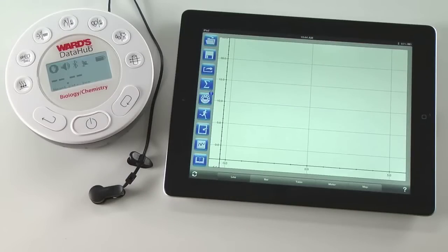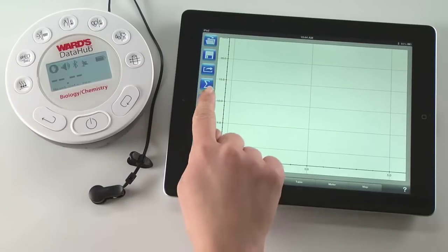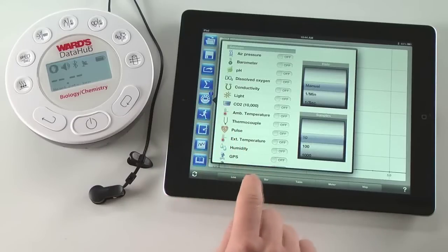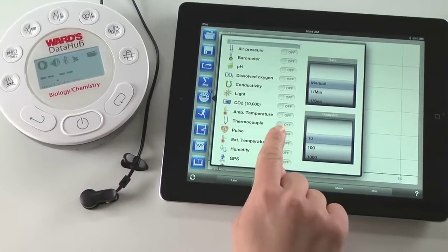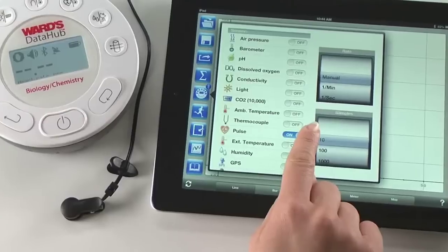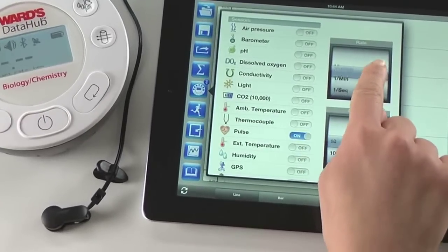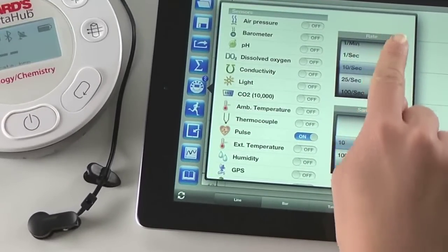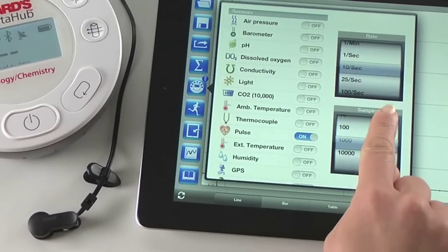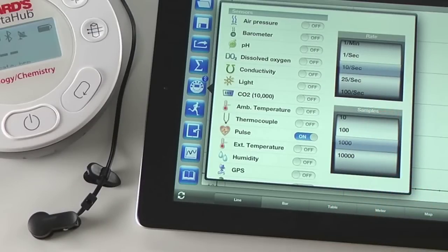First, open the setup screen on the Ward's DataHub analysis software on your iPad. Next, select the heart rate sensor. Then set it to measure at 10 samples per second for one thousand samples. Now we're ready to start the experiment.